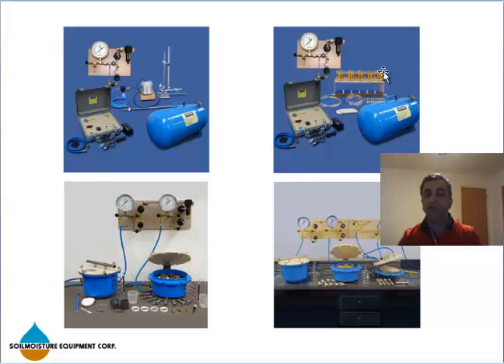The advantage of a Tempicell is that it is faster in reading, and it's more convenient. It's a very popular method, and the range of application is between 0 to 2 bar. You can use it for pressure application or vacuum application.